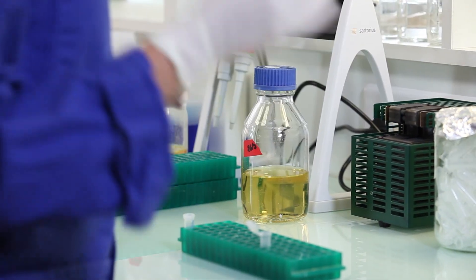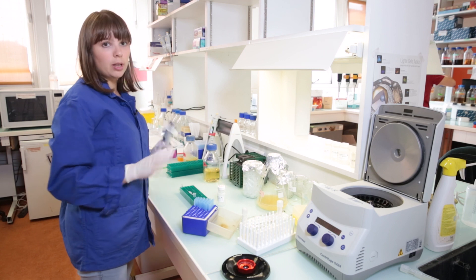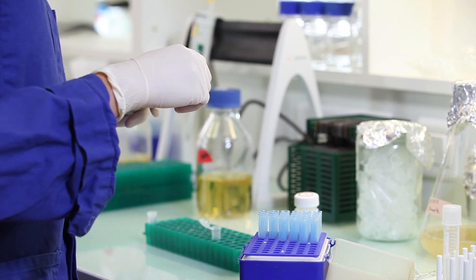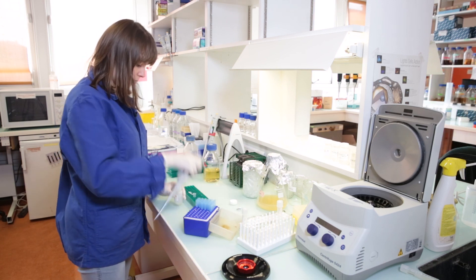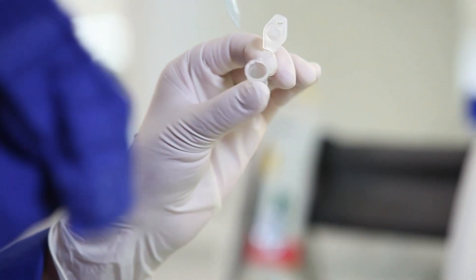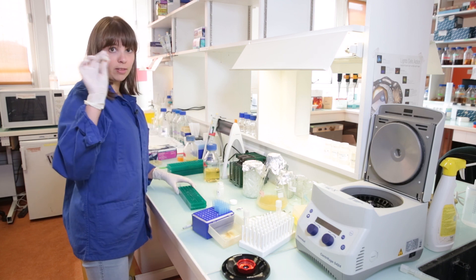First step is to add cell lysis buffer. Usually for mini preps you will be using a commercial kit and all the solutions already come prepared for you. The kits differ a little bit between brands but the principle is the same. First we are adding the cell re-suspension buffer — 200 µl of this buffer — and the point is to re-suspend the cells in this solution. So we pour it into the tube, and then the pellet is re-suspended.